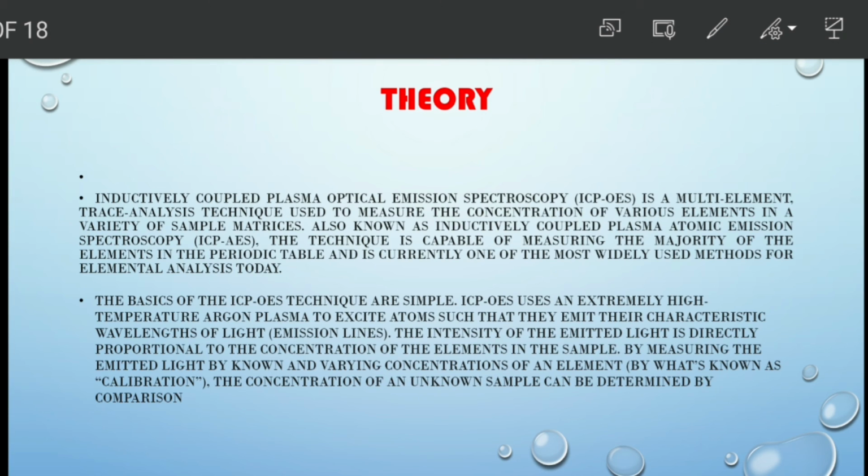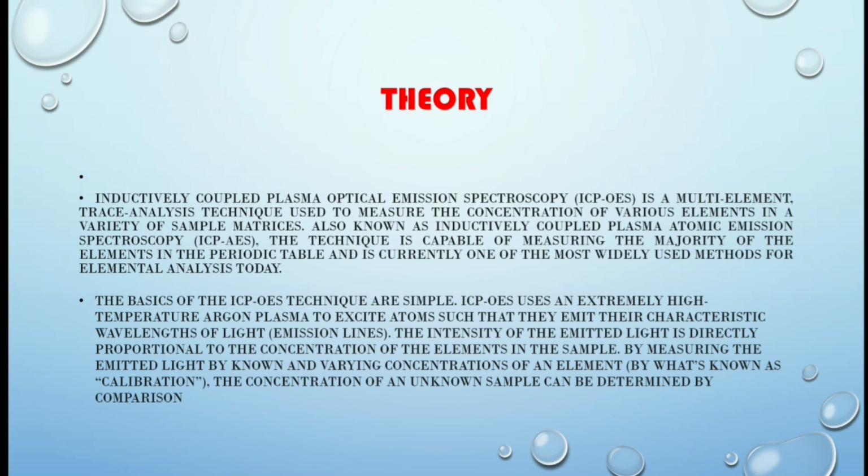Let's talk about the theory, a little more detail of ICPOES, that is inductively coupled plasma optical emission spectroscopy. ICPOES is a multi-element trace analysis technique used to measure the concentration of various elements in a variety of sample matrices.